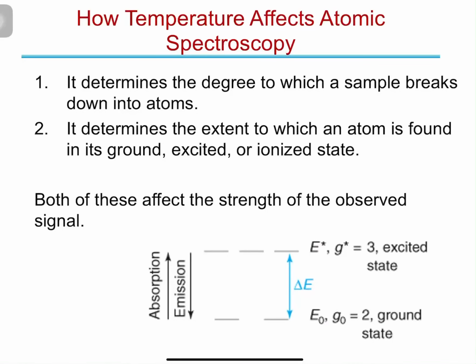Now let's talk about the effect of temperature on atomic spectroscopy. Is it important to control the temperature in atomic spectroscopy, or does it not matter if there is a change in temperature? First of all, let's talk about the role of temperature in atomic spectroscopy.